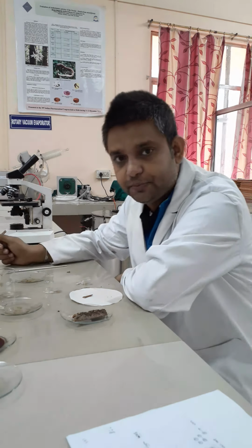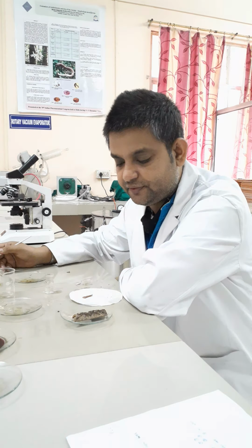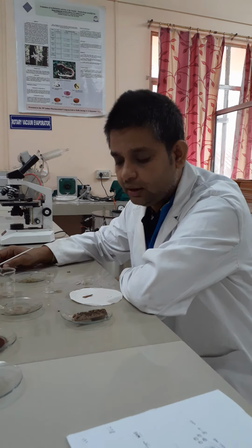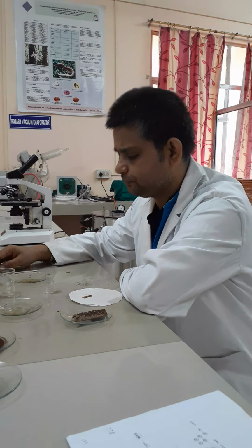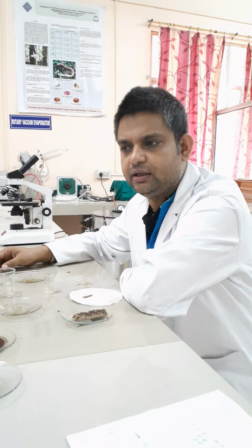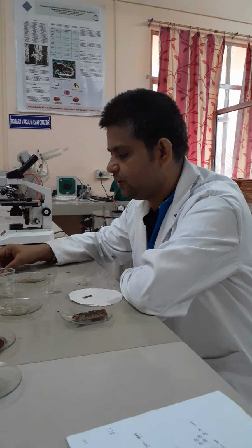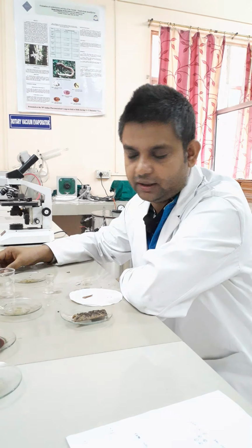So in today's experiment, we are going to perform the microscopy and transverse section of another bark known as Cinchona. Cinchona is a well-known traditional medicinal plant. As we know, it is a very famous anti-malarial drug.